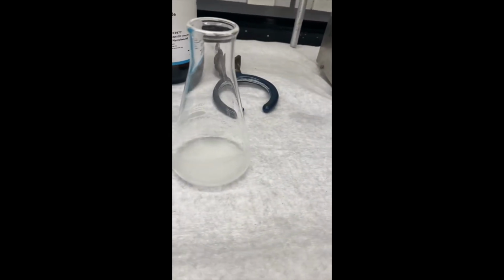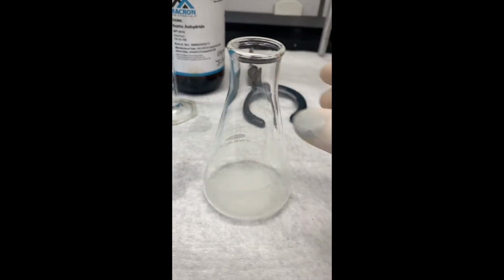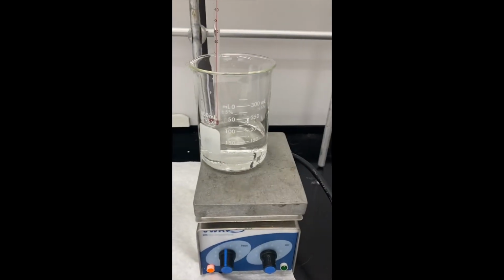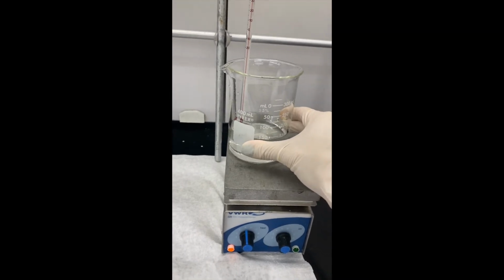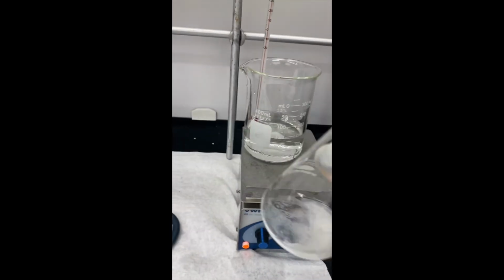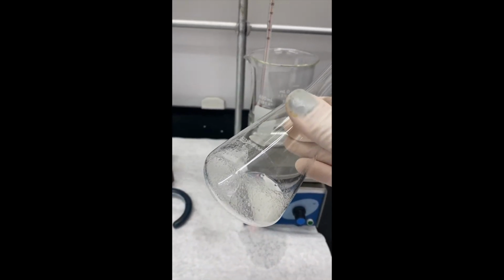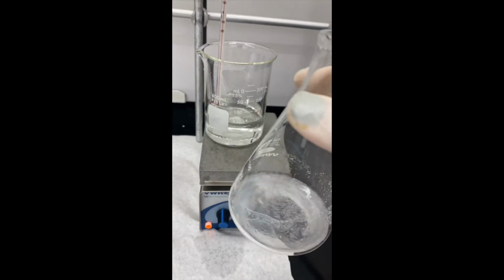And what we want to do is to heat this reaction. We're just going to gently warm it to about 50 degrees Celsius just to get that salicylic acid into solution. So I've got some water here heating on a hot plate, starting to get a little bit warm. Once I do that, we want to see this solid hopefully dissolve and then crystallize back out. So we won't heat this very long, maybe for about 6 minutes or so, but I'll keep you guys posted on that.